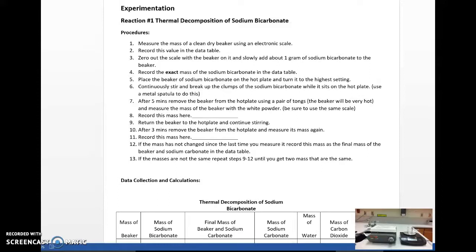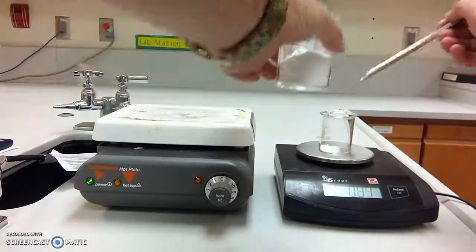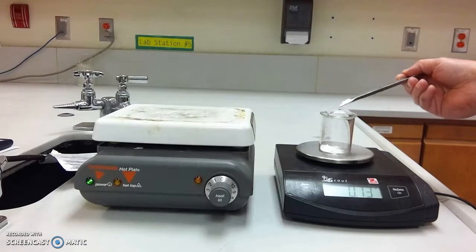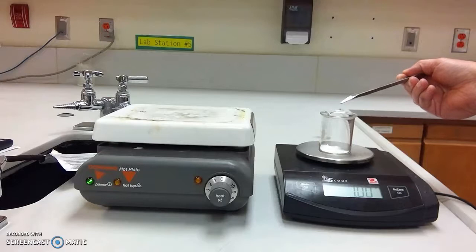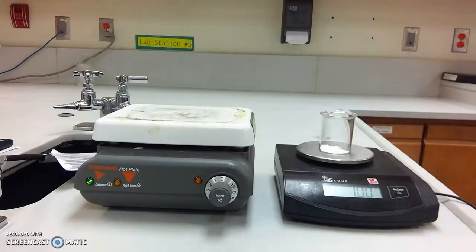Then step three, zero out the scale. So I'll go ahead and zero it out. And I'm going to slowly add one gram of sodium bicarbonate to the beaker. Always want to make sure that you are paying attention to what's around you, your workspace. You don't want to spill. You just want to slowly add it in there until you get about one gram. I got it to 1.00 grams, so that's good.